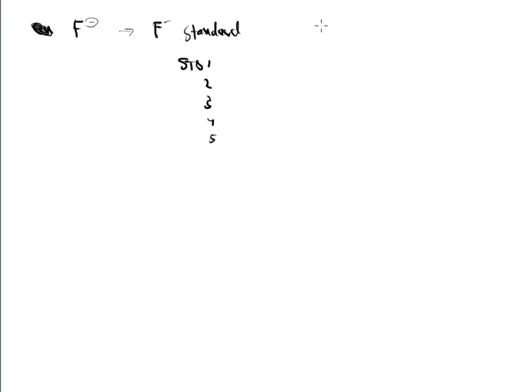And that point is going to come from a primary standard. And this primary standard typically is ordered, not every time. Sometimes I'll make them, but they are typically ordered. It's easier that way. And they come with what they call a certificate of analysis.